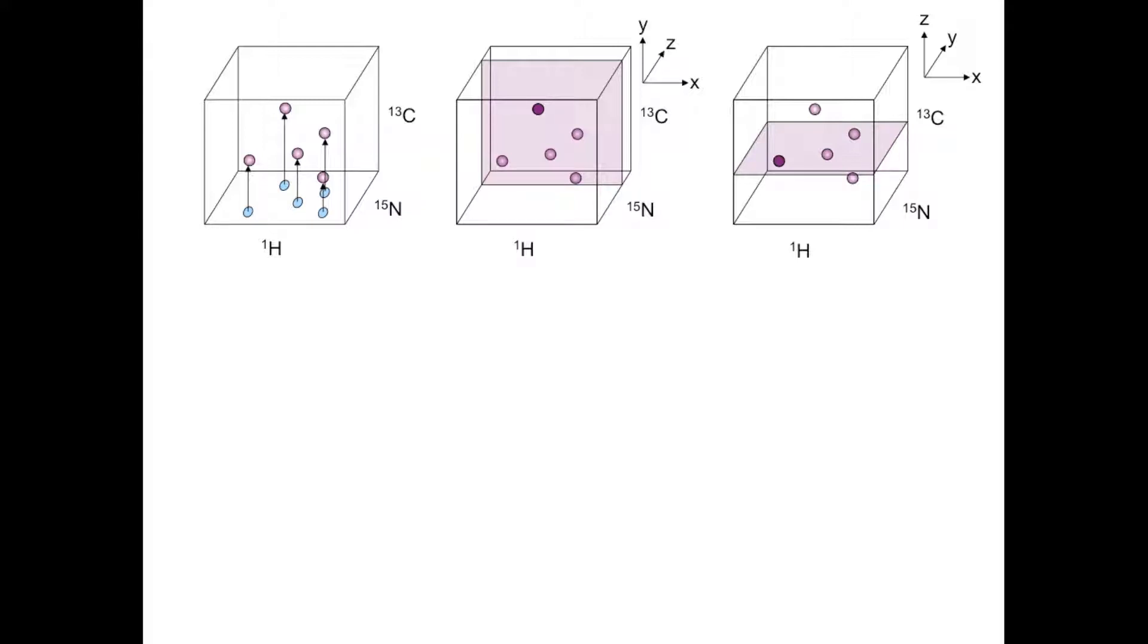If you look at each plane, they potentially have lots of empty space if they only contain one peak. So a lot of the time we don't look at the whole plane, but just a thin strip either side of the peak of interest.